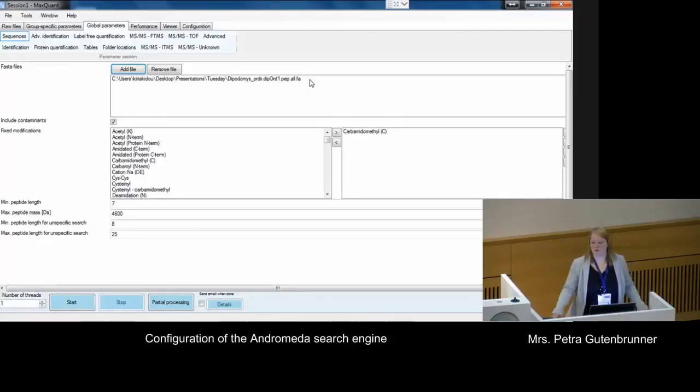On UniProt, you can also define that you want just reviewed or unreviewed entries, so you have a better option to customize your FASTA files. But other than that, they are the same. I think the databases are also synchronized, so the content should be the same after a while.